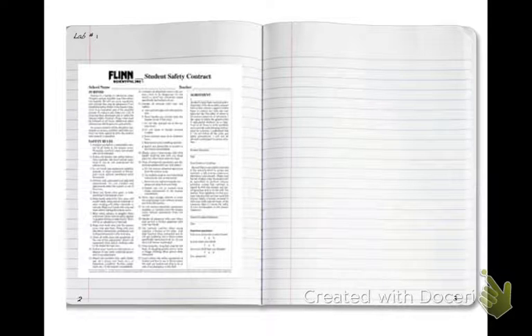All right. Also, continue to put the lab number on the back of this page. If this lab or any of your labs went on for like 5 pages, for example, you're going to write the lab number, whatever it is, on each of the 5 pages, front and back. And don't forget, this is on the outside corner, so you can easily flip it and see it. You tape the top and bottom. Don't forget to make sure your initials and your date are on there as well. All right, and so that's page 2.